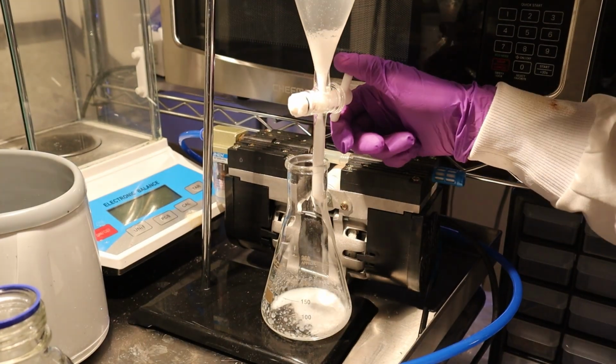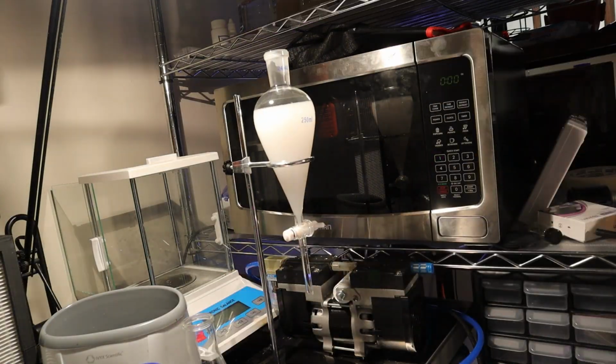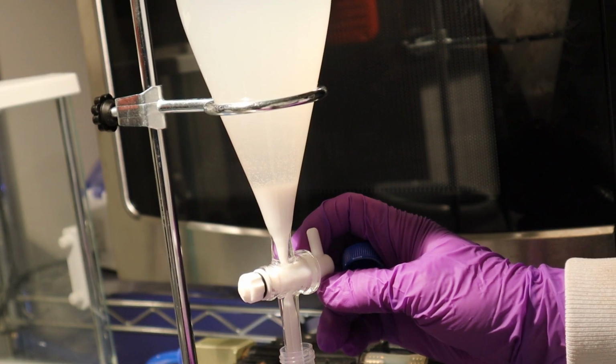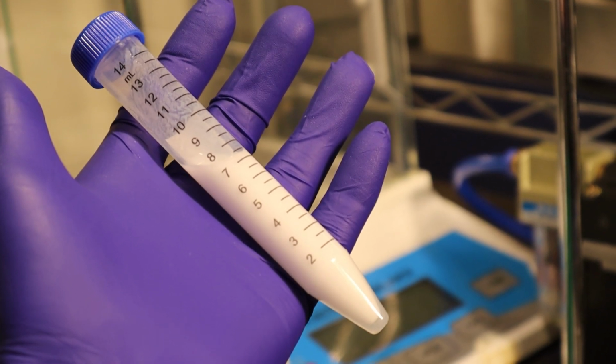My friend, now no longer present, I ejected off the powdery bit and added more acetone. I then put that in a smaller separatory funnel, ejecting off any precipitate that formed. Now I'm left with around 9 mils of wet streptomycin precipitate.